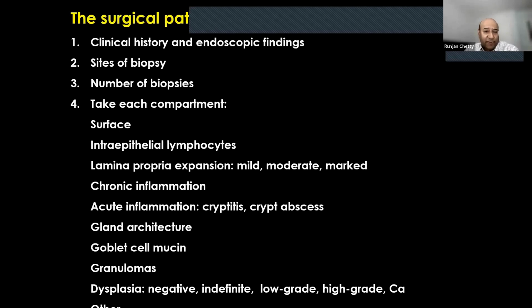Take note of the sites of biopsies, and I know that there are hospitals which clump the biopsies into one cassette, clustering cecum, top left and middle right is the descending colon, etc. It's a practice that I would certainly not advocate when looking at cases for IBD, especially if it's a colonic series. I would strongly advocate that the sites are separated into different pots and different cassettes.